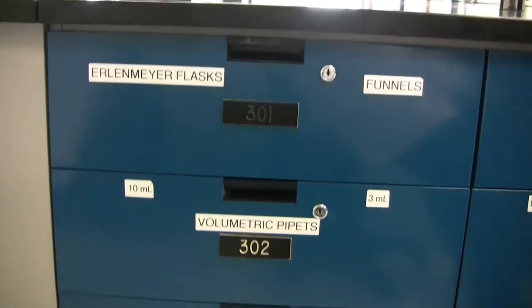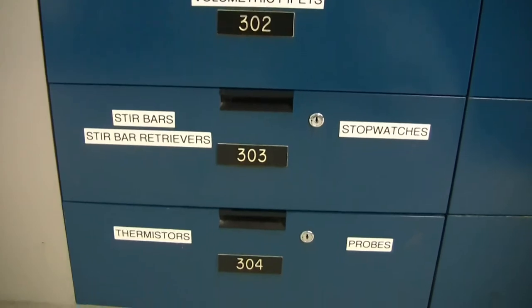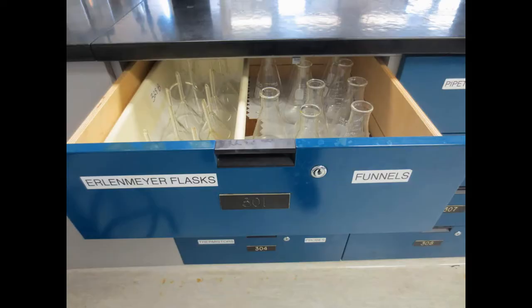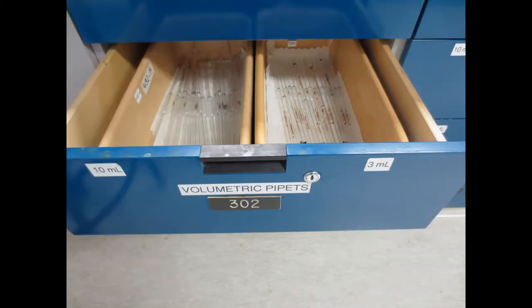The first few drawers are as follows: Erlenmeyer flasks and funnels. Volumetric pipettes, 10ml and 3ml.